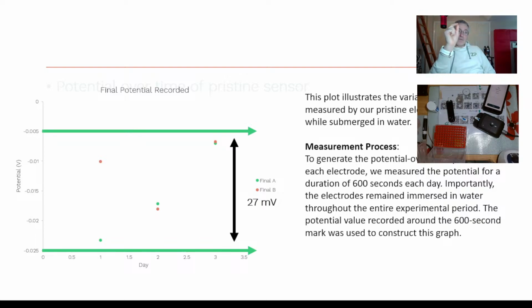But if you look at OCP sensors like pH sensors, every time you walk up to a pH sensor in the lab, the first thing you notice is there's a couple of calibration solutions there. So it tells you that OCP sensors, open circuit potentiometry sensors, of which pH is the biggest measurement used in the world, drift, and that's why those calibration solutions are in place.